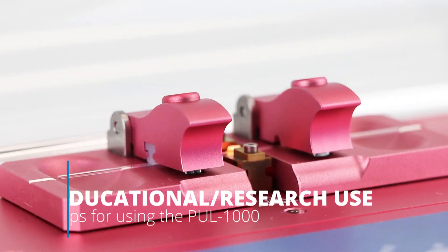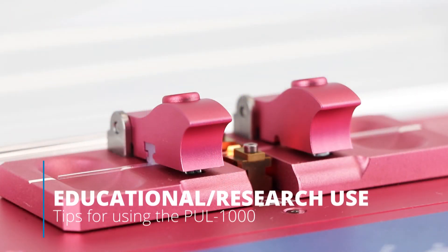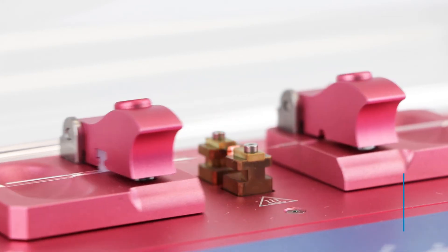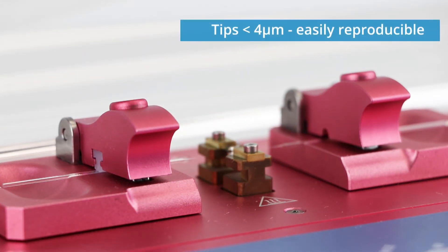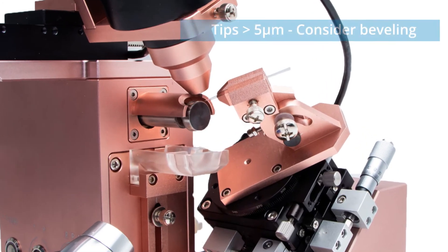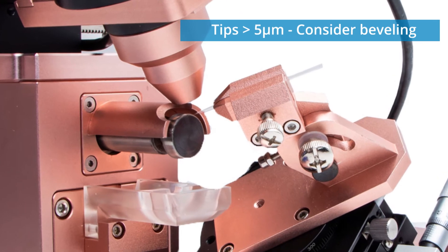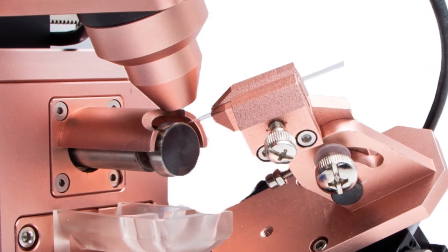This puller is for educational and research purposes. It's not really a production puller. Pulling tips less than four microns is easily reproducible. For consistent tip diameter greater than five microns, use a second pulling operation like beveling.